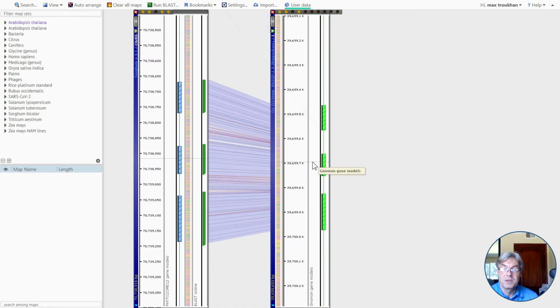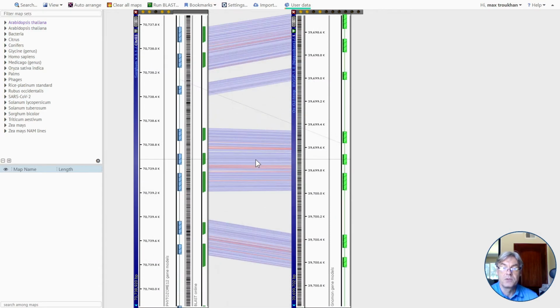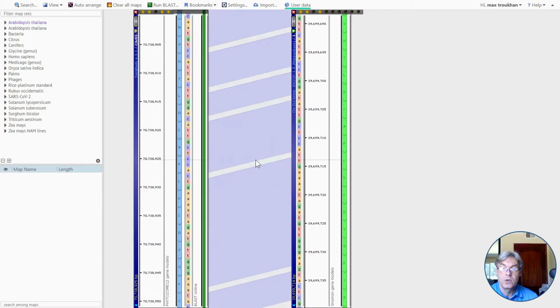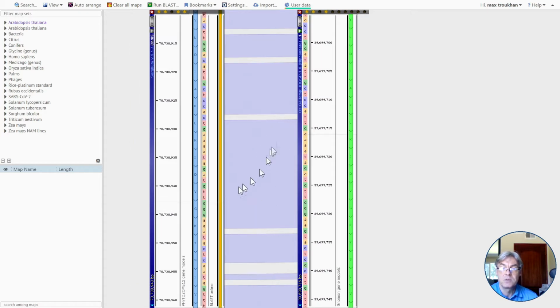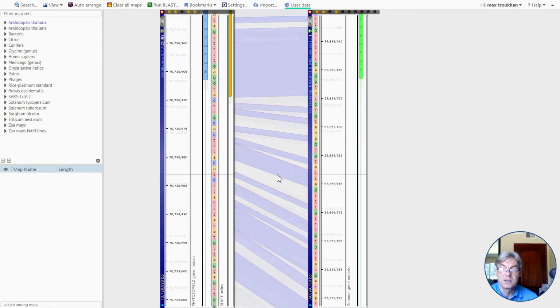So again, the indels just get together inside introns but not in exons, because nature will not tolerate them inside exons. Okay, so just a quick observation by looking at the graphics. If you zoom further, you will see, yes, these are just identical DNA sequences with some mismatches here, or if you look at the intron part, these are indels.